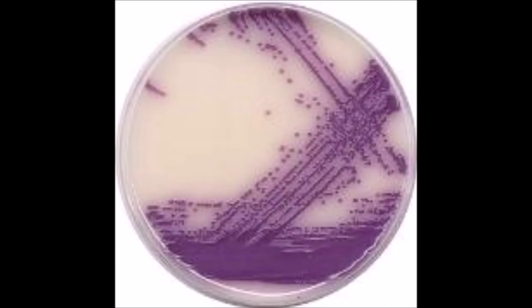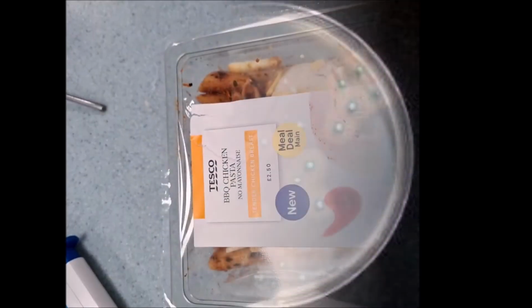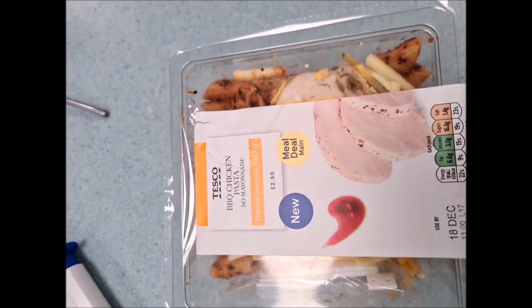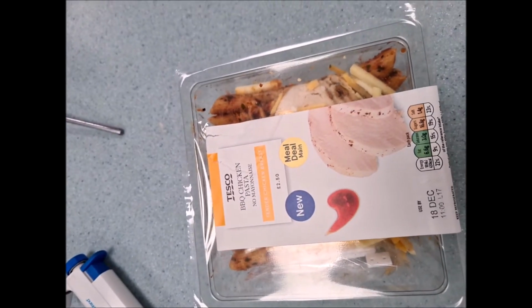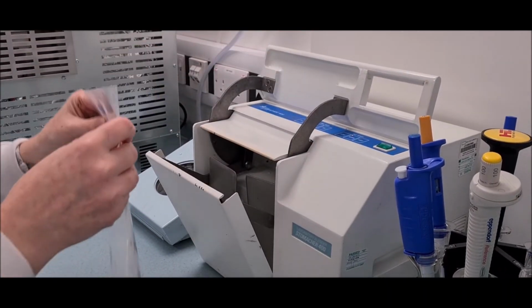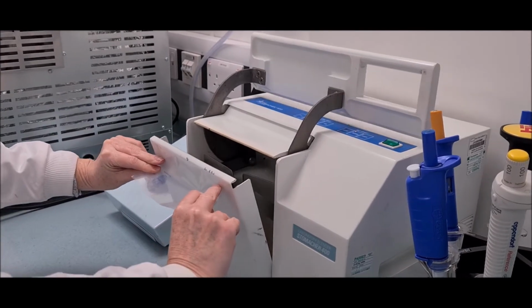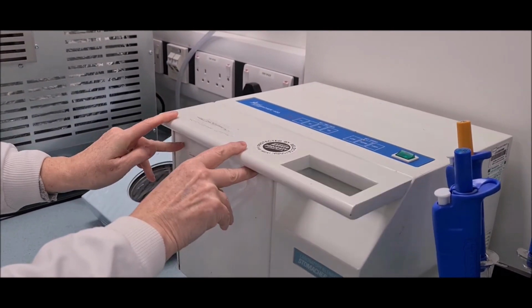For the detection of Salmonella and Listeria, guidelines require that 25 grams of food is tested instead of 10 grams. The food sample is transferred into a stomacher bag and 225 ml of enrichment broth is added. This is then stomached and incubated overnight before streaking onto respective selective media.